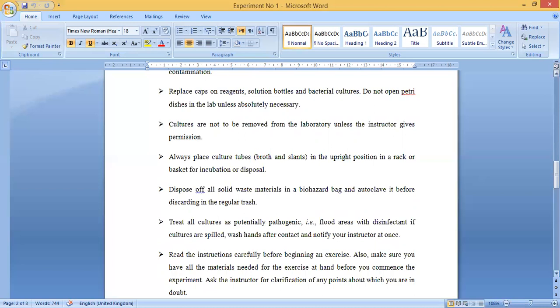Cultures are not to be removed from the laboratory unless the instructor gives permission. Cultures must remain in the lab and must not be taken away by students, as cultures are hazardous. Always place culture tubes — whether broth or slants — in an upright position in a rack or basket for incubation or disposal; otherwise the broth or slant will be wasted or contaminate equipment.